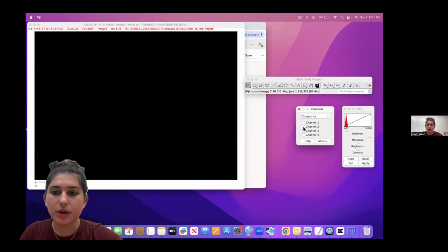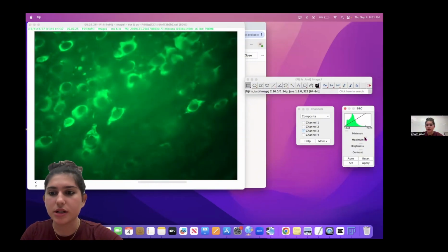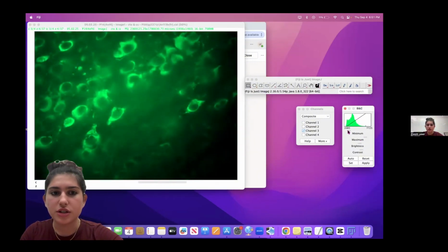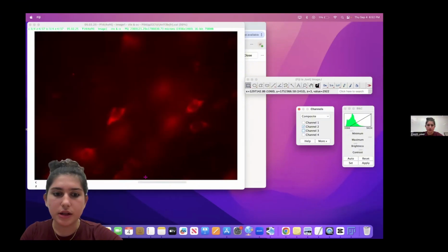And also, for example, let's say we want to mess with PS6, right? We go to the third one, PS6, where it's green, and then we can change the brightness and contrast, just to try to get what image we're trying to look for at that moment, right? Just go right over here, and then let's see, this is CC1.